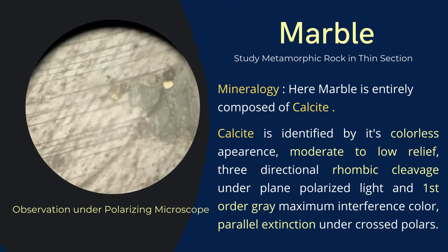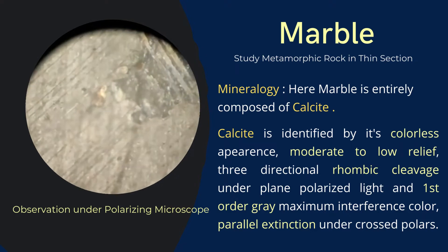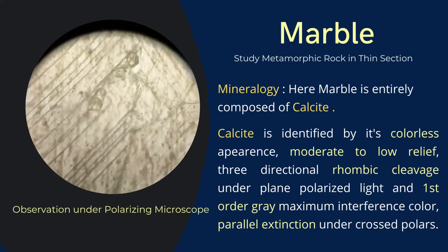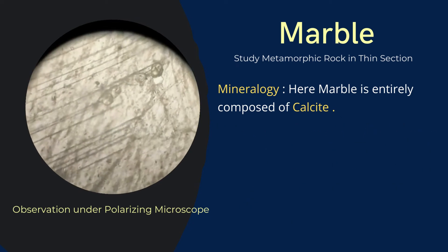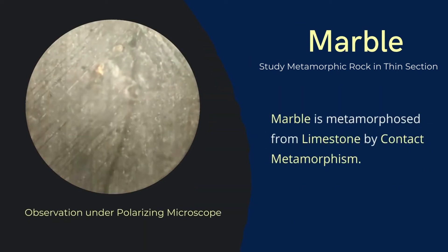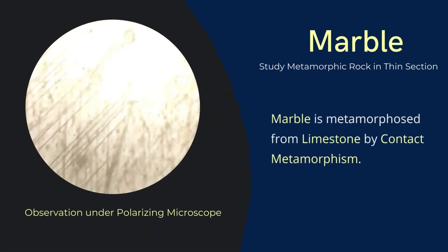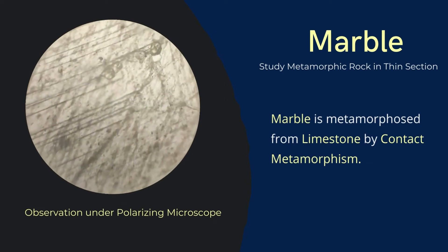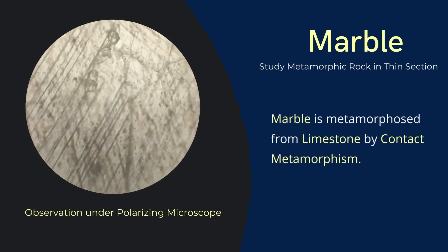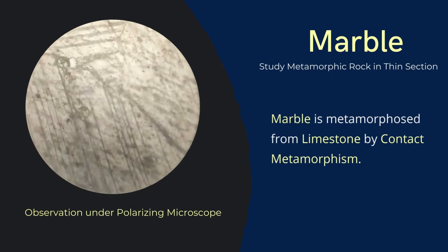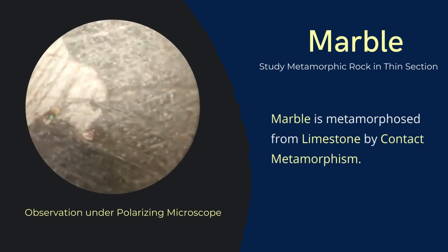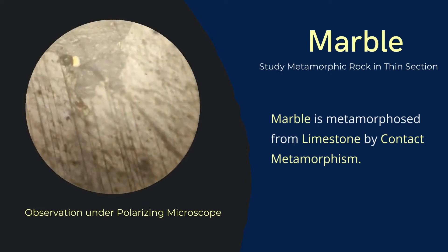Under crossed polarized light, calcite shows first-order gray maximum interference color and parallel extinction. The non-foliated structure, granoblastic texture, and mineral composition confirm that the rock is marble, which is metamorphosed from limestone by contact metamorphism.